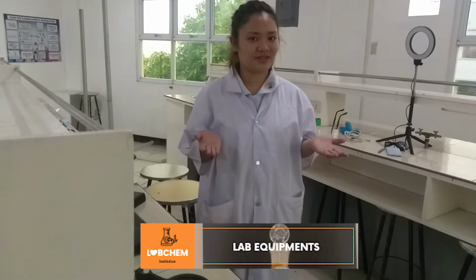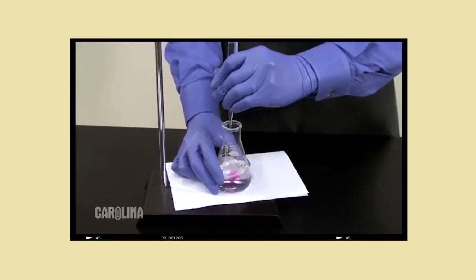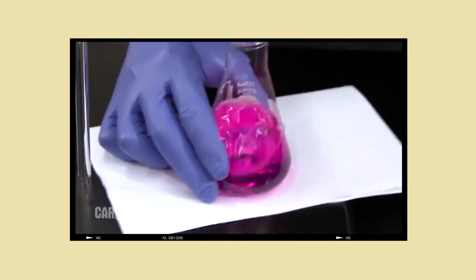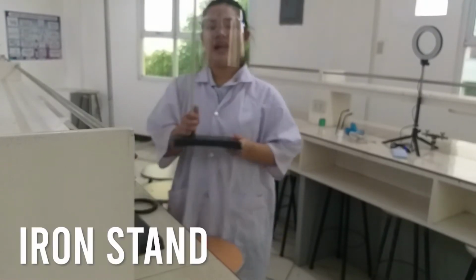Aside from lab equipment used for measuring and glassware that is not used for measuring, there are also what we call tools for titrations. But first, what is a titration? Titration is the process of chemical analysis in which the quantity of some constituent of a sample is determined by adding to the measured sample an exactly known quantity of another substance with which the desired constituent reacts in a definite known proportion. The laboratory equipment that is often used for titrations is the iron stand.